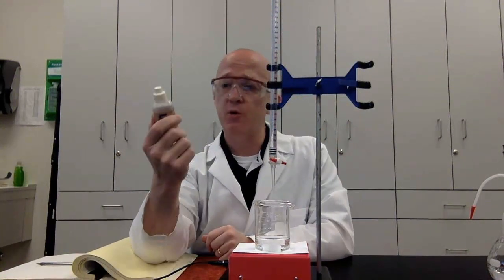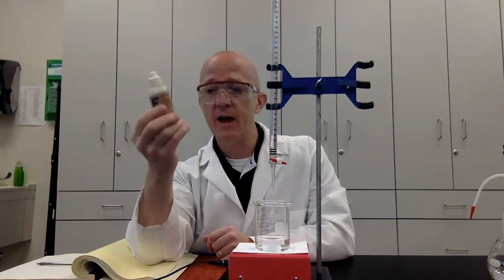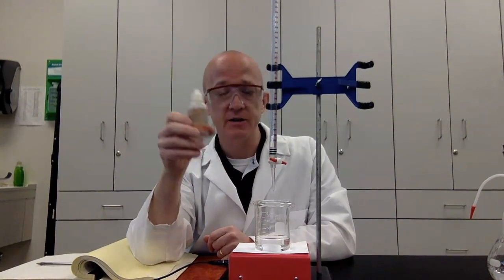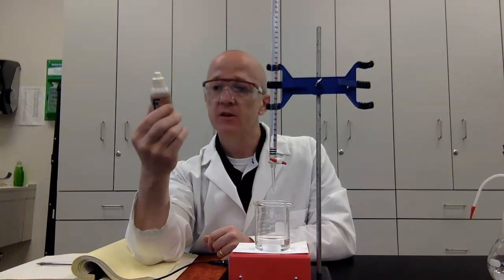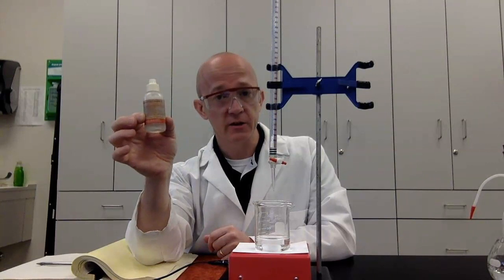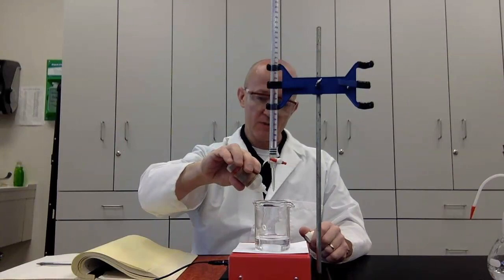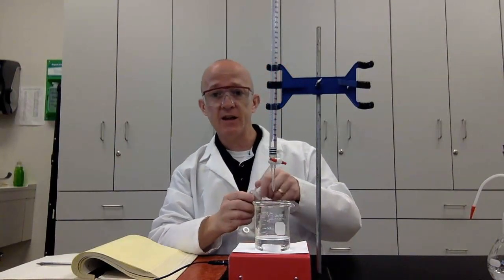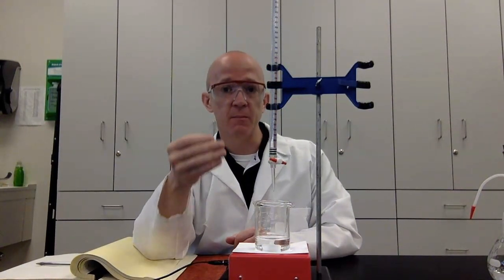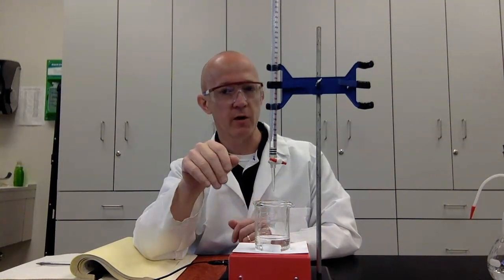Now before I start, I'm going to put a few drops of this into it. You might be asking what this is. This is an indicator, an acid-base indicator. It will change color depending on the amount of hydrogen ions or hydroxide ions in the solution. Pretty cool, huh? This one's called phenolphthalein, and it starts out as being clear, and it will stay clear as long as you have an acidic environment. So if I place a few drops in this weak acid, it will still remain colorless. But when phenolphthalein is exposed to a basic environment, it changes color. I don't want to give it away. It's pretty cool though. All right?